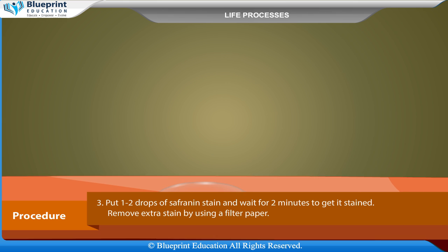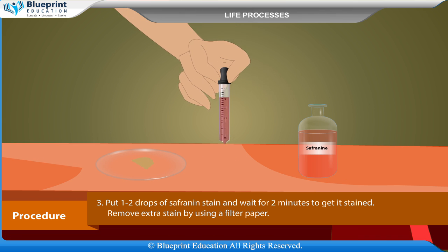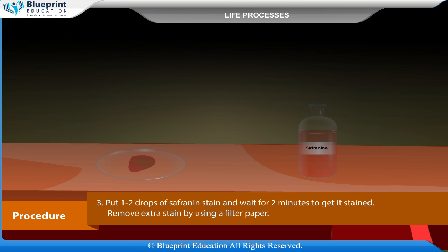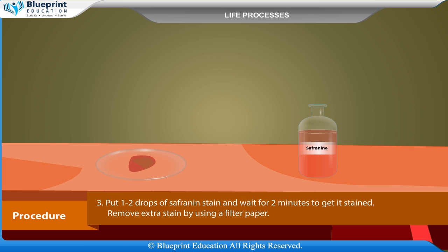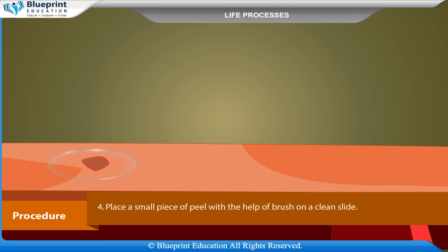Put one to two drops of safranin stain and wait for two minutes to get it stained. Remove extra stain by using a filter paper. Place a small piece of peel with the help of a brush on a clean slide.